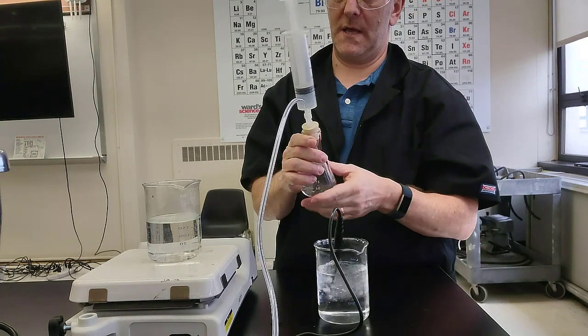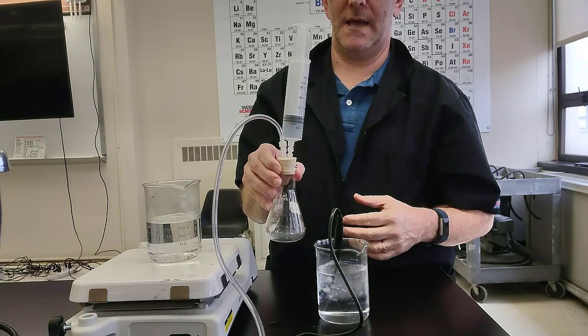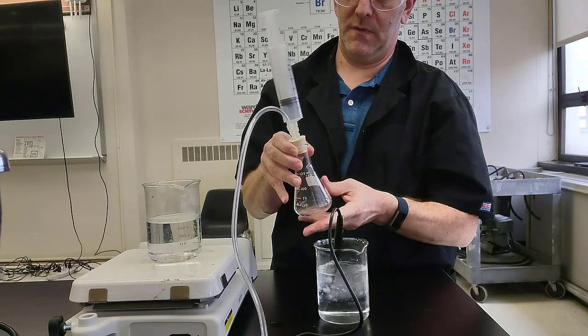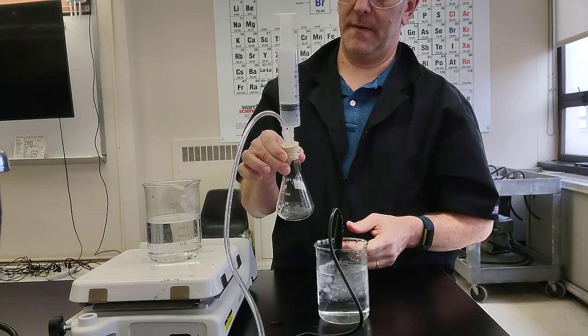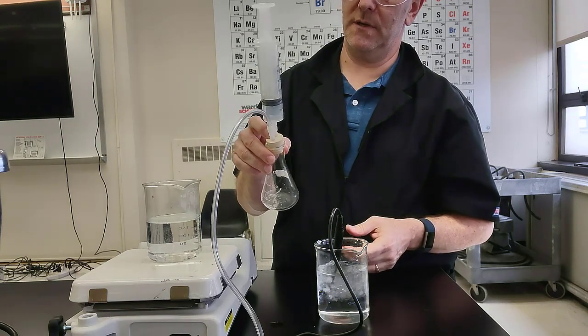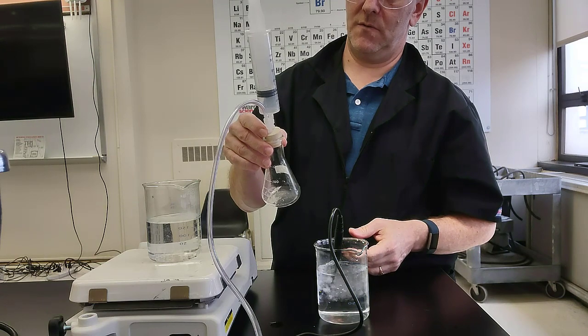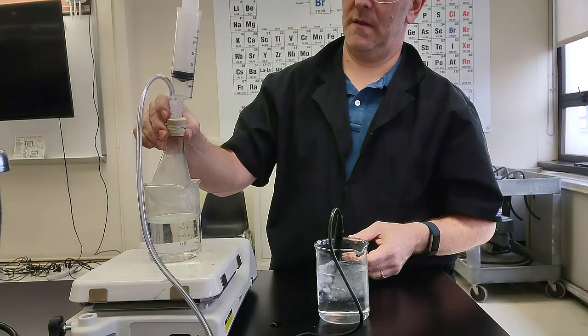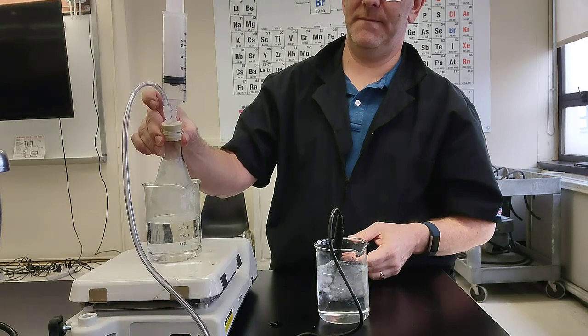I want to go straight into the hot water bath, just so you can see it again. Give it a whack once it gets a little warmer. And I don't want to shoot the syringe in my face or potentially explode the flask. So I'll hold it in the steam.